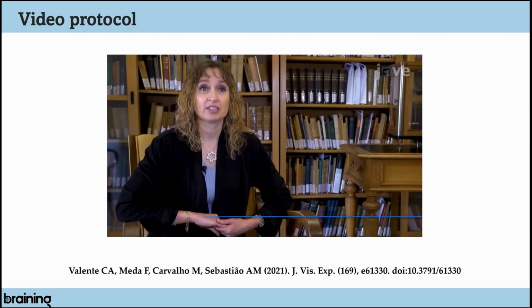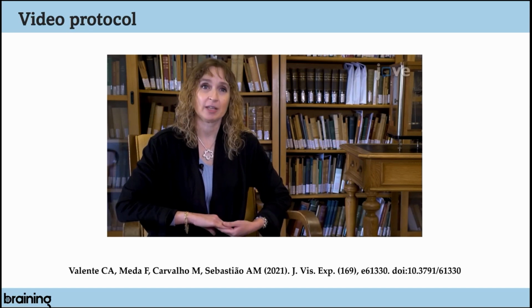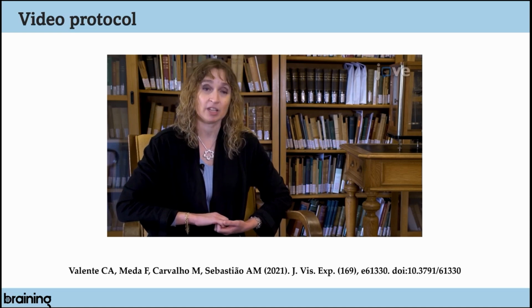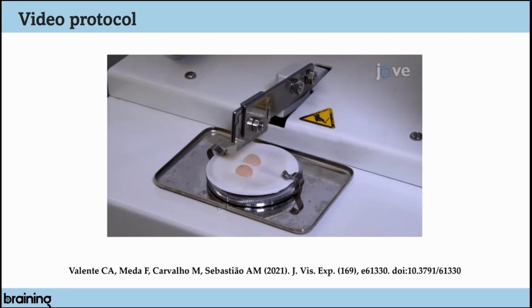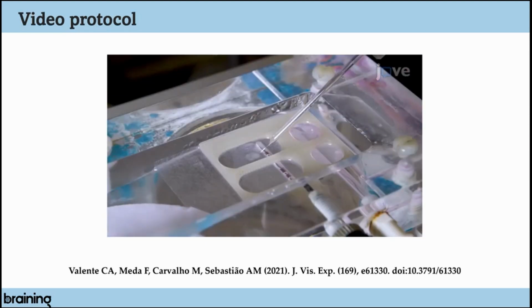Epilepsy is a prevalent neurological disease. Rhinal cortex-hippocampus organotypic slices depict evolving epileptic-like events that resemble in vivo epilepsy and can therefore be used as an ex vivo model of epileptogenesis. This system is indeed an excellent tool for monitoring the dynamics and progression of epileptogenesis, as well as for screening potential therapeutic targets for this brain pathology.